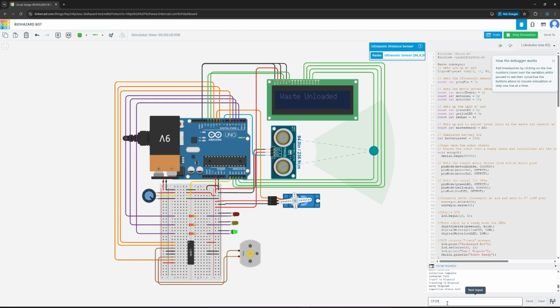We also have a stop function here, which indicates that it is an emergency stop and the robot has stopped moving. You can see here it displays an emergency stop.